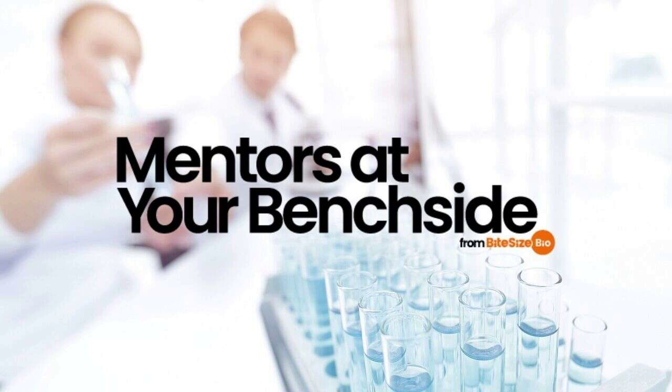Eosin is anionic and acts as an acidic dye. It is negatively charged and can bind to positively charged acidophilic components in the tissue, such as amino groups on proteins in the cytoplasm. These are typically stained in various shades of pink.